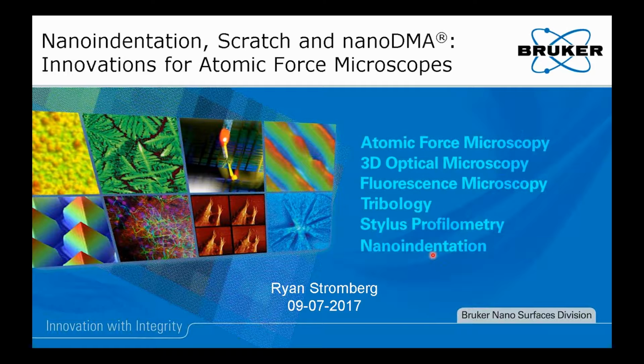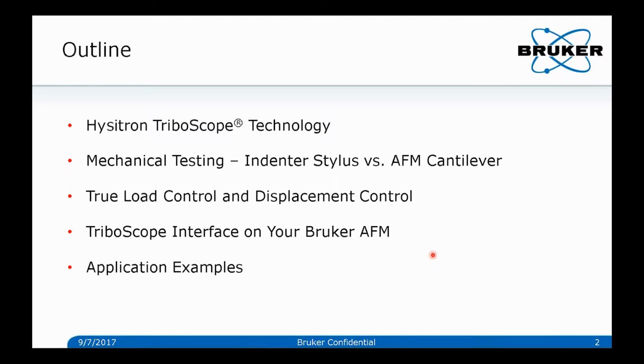Thank you, Jeff. It's my pleasure today to be presenting on nanoindentation, scratch, and nanoDMA, innovations for atomic force microscopes. So essentially today I'm going to be talking about the Hysitron TriboScope instrument that interfaces with a commercial AFM and adds quantitative nanoindentation capability. This is the outline of the talk.